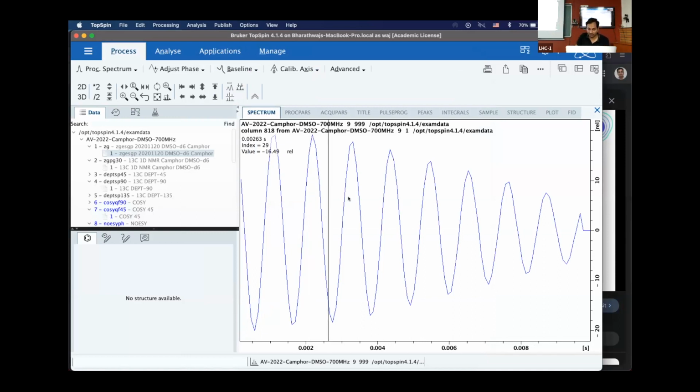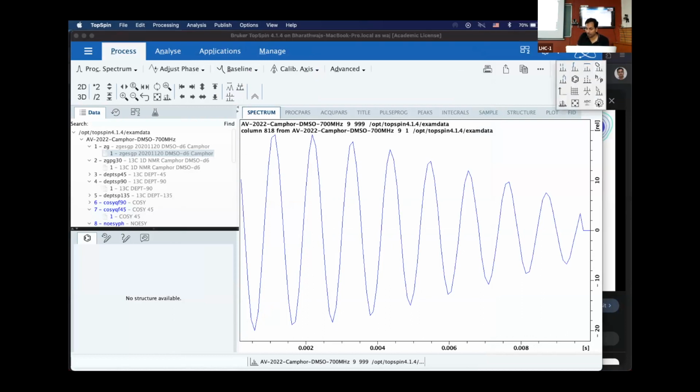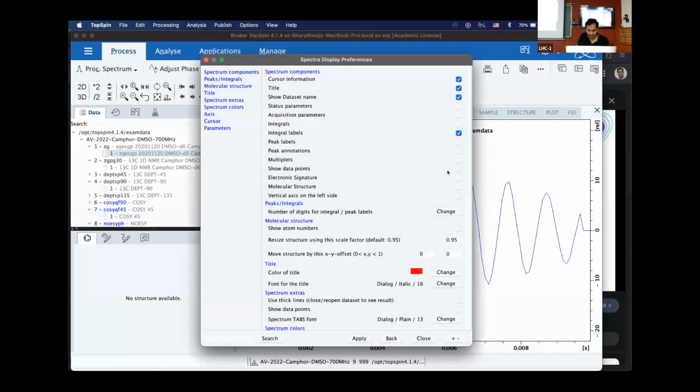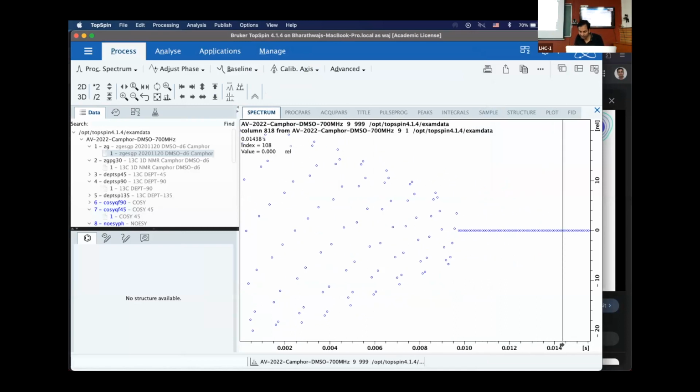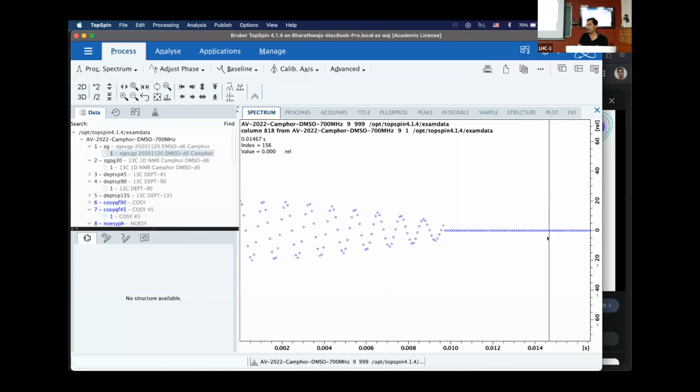Right? If you slowly sit and now we can show the data points again, so that you guys understand one more important information. If you sit and count in this, you will be able to count 128 points. You might ask what's happening after those 128 points. We have done something called zero filling. All those are just zero. These are just padded. You just put those numbers yourself.